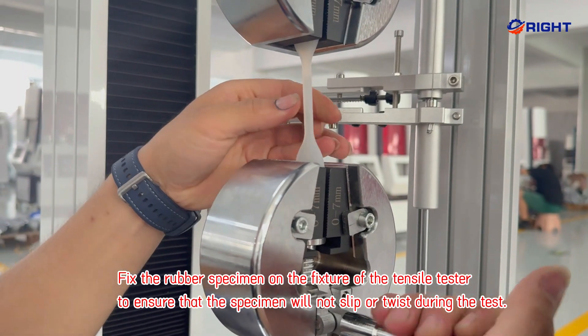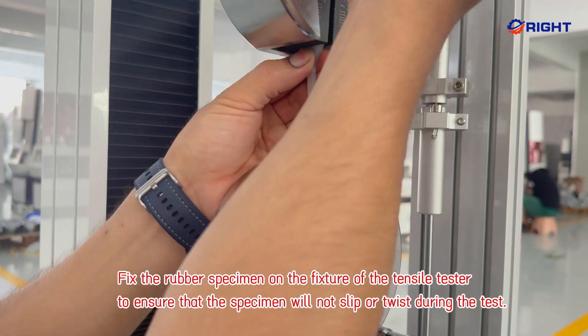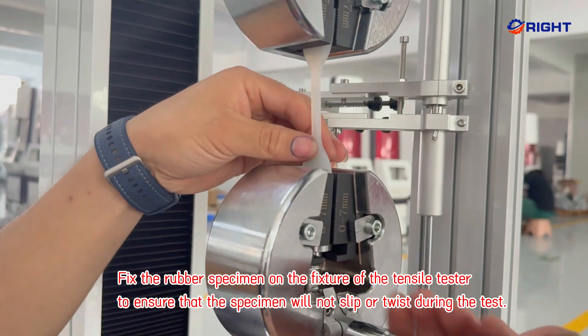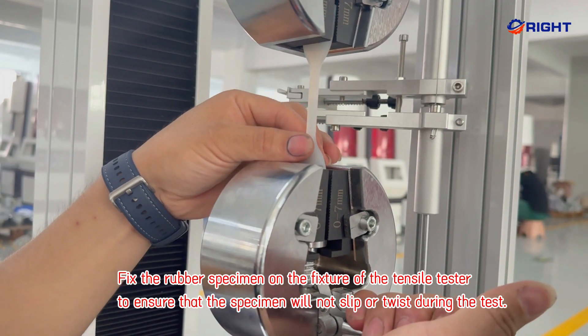Fix the rubber specimen on the fixture of the tensile tester to ensure that the specimen will not slip or twist during the test.